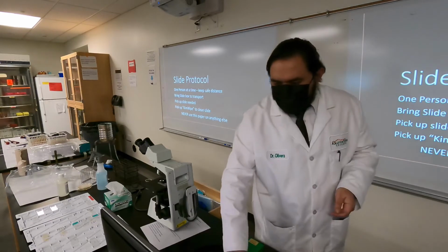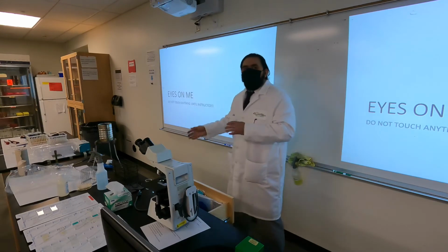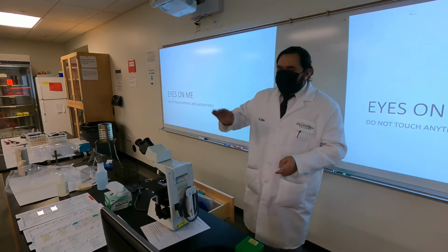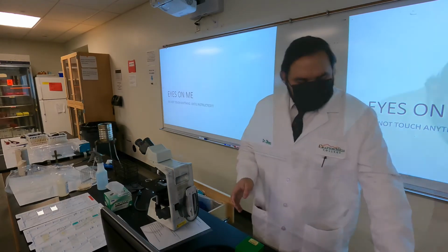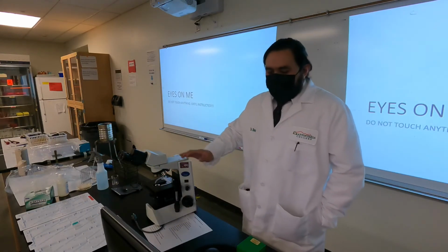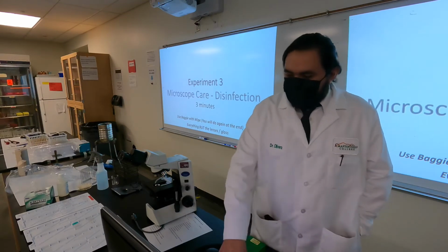So the next thing we're going to do is I'm going to walk you through it first on the scope, and then you'll do the follow-the-leader type of thing. So let me walk through the care, the disinfection, all the steps really fast. We'll stop and go, and then we'll accomplish everything. So that's the plan for now. All right. So let's demo it first to make sure you can set it up. The first thing we did is obviously we want to make sure we disinfected it before and after. That was the main thing to do, right?